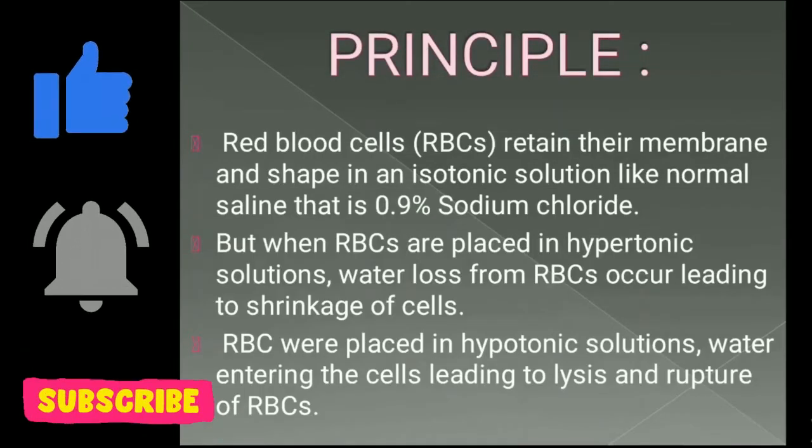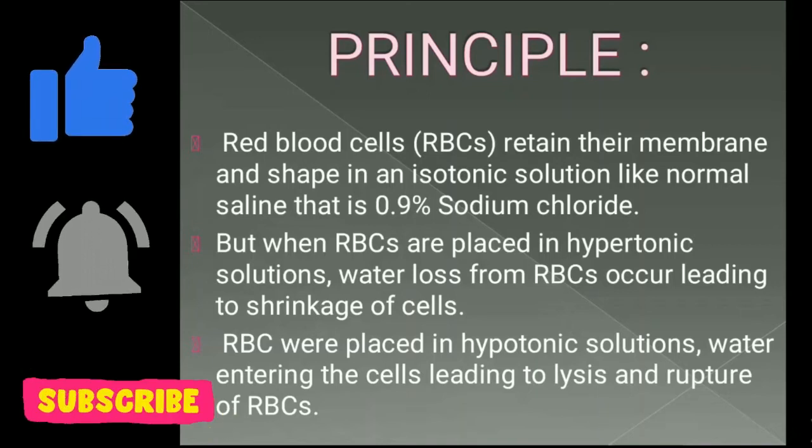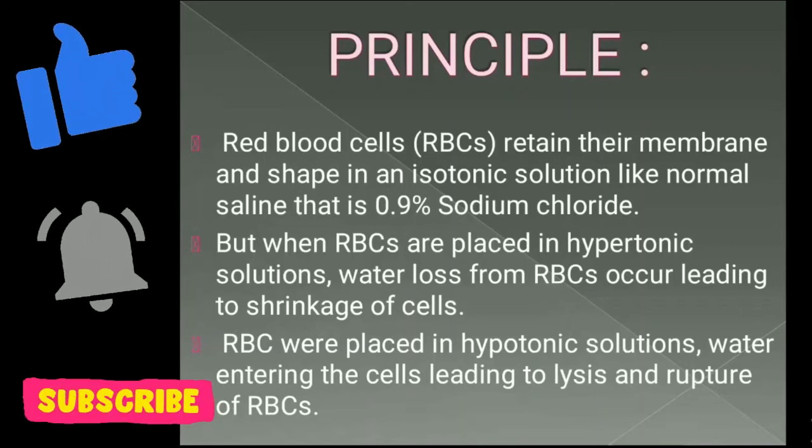This experiment is based on the concept of osmosis. Osmosis, as we all know, is a process which involves the movement of water molecules from a region of low concentration to a region of high concentration.